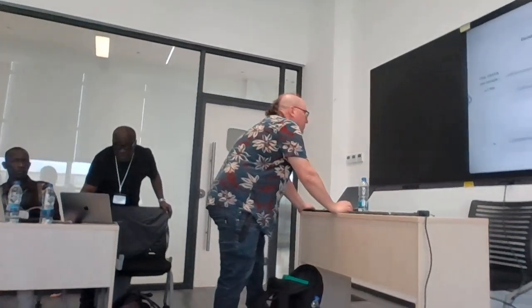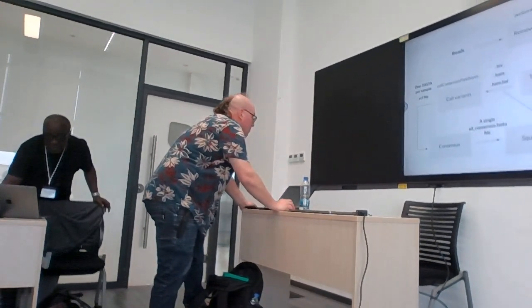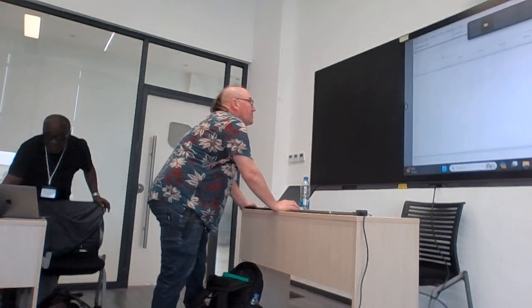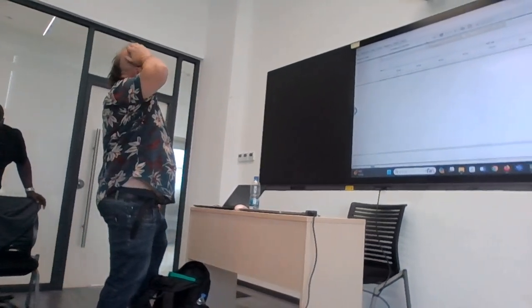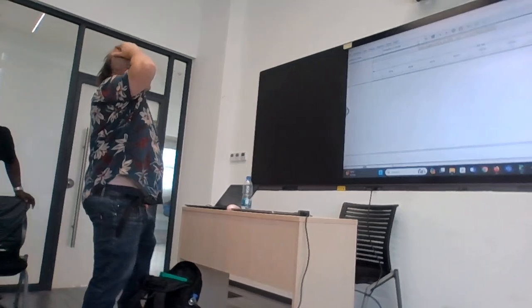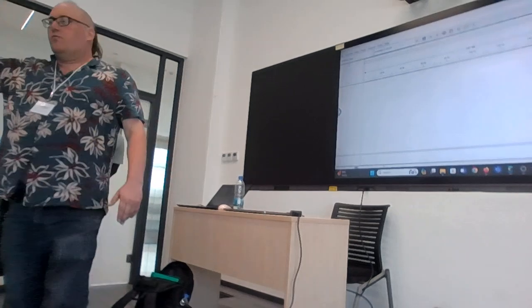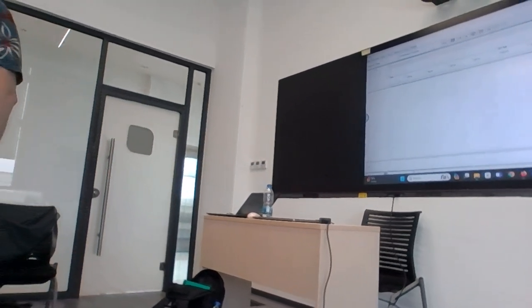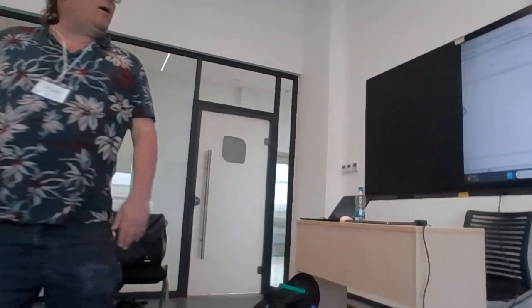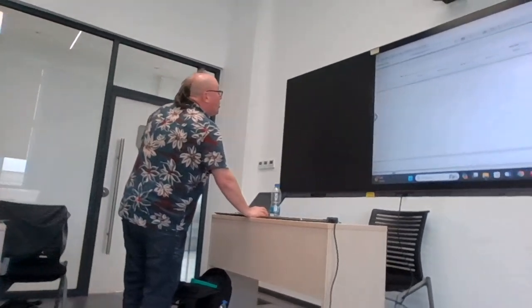Okay, I'm just thinking, how am I going to present this all to people? How can I distribute this genome? Before I can look at the reads, I need to know which reference I used, okay? And so I'm going to load the genome from a file.